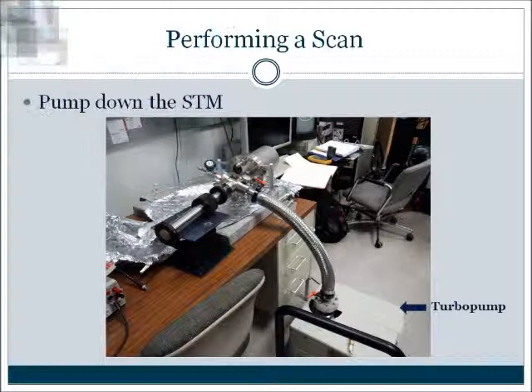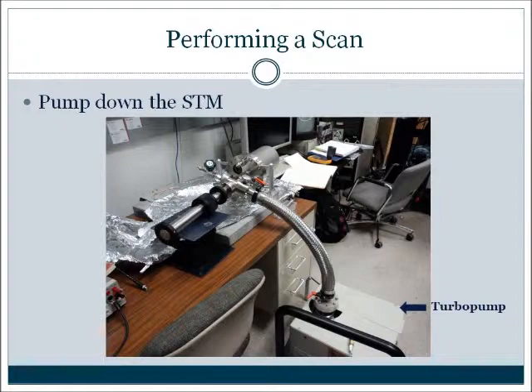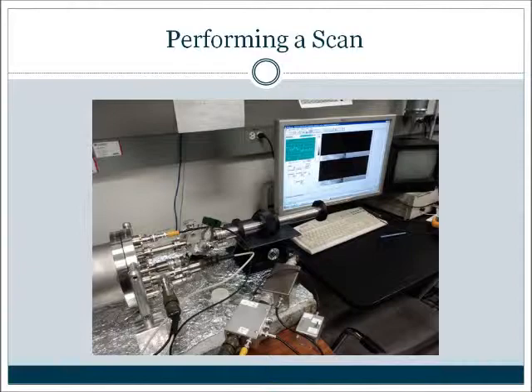Before hooking up all the electrical connections for performing an STM scan, we pump down the chamber into vacuum using a turbo pump, shown here. In STM, a current is passed through the tip and sample, generating an image of the surface line by line. We can then pick a point on the image to perform STEM on. This is a scan of HOPG. The topography for the forward and backward scans are shown on the left top and bottom. The current for the scan is shown in the image on the right.